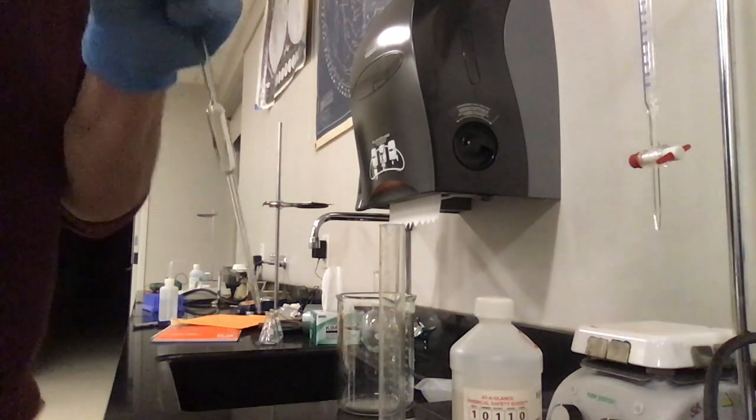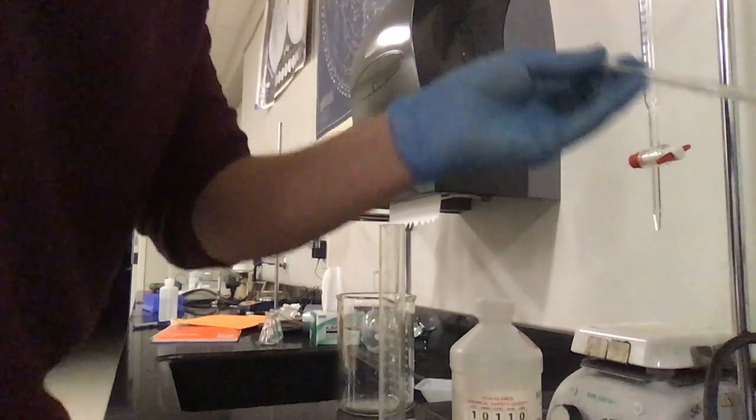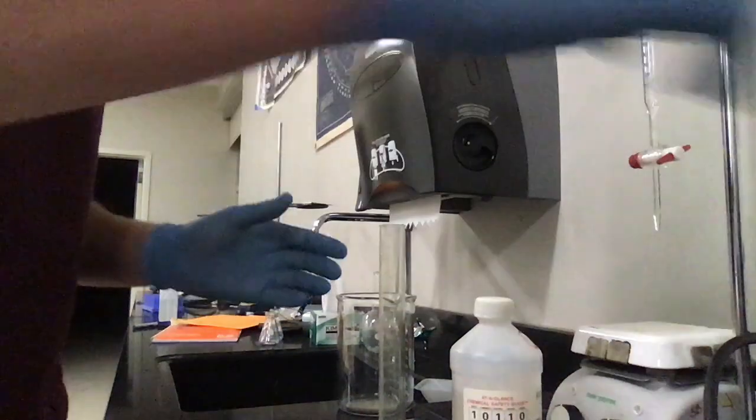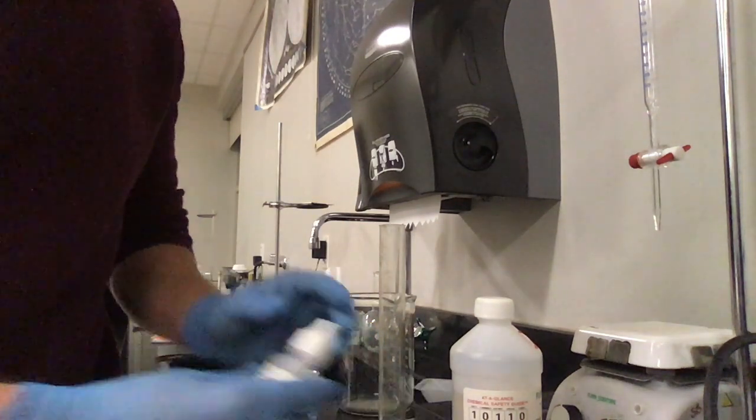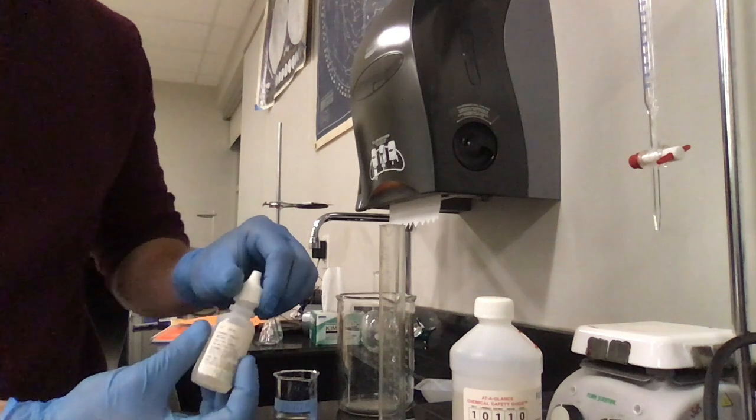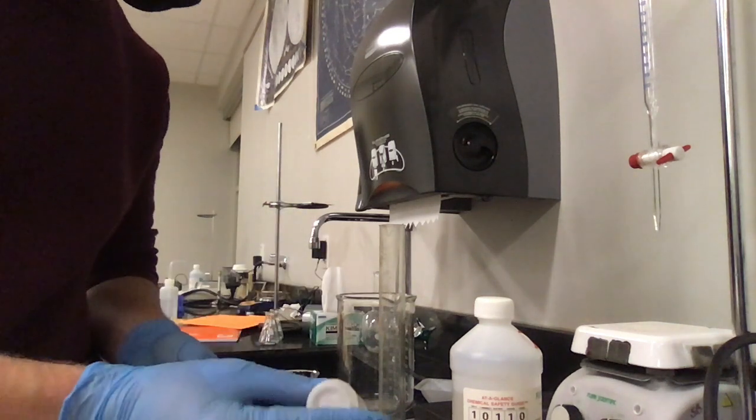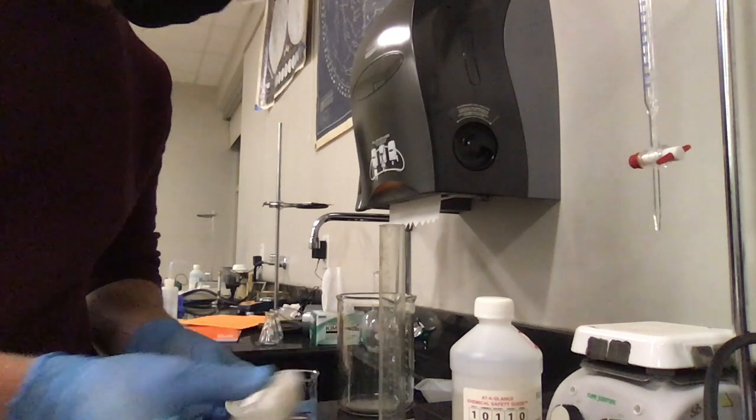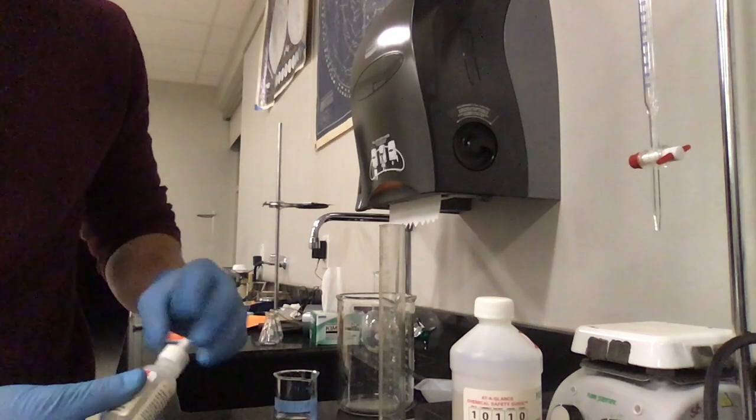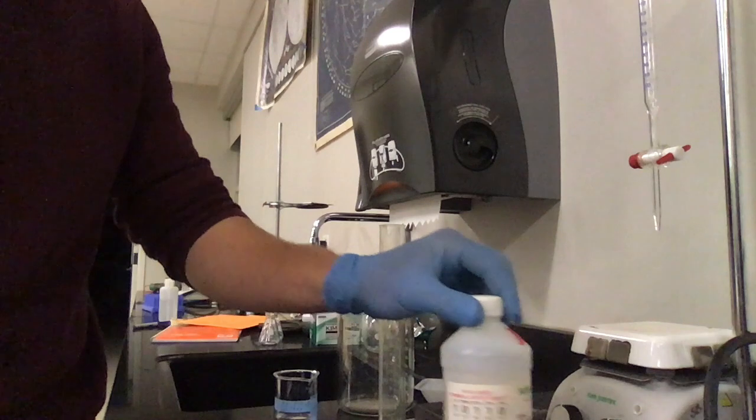I'm going to set this aside because we're going to use it again because I'm going to do three trials for this particular lab. Okay. Now I have unknown acid inside of my Erlenmeyer flask. I'm going to add a drop or two of my indicator. Don't forget the indicator. You'd be amazed. Unsurprisingly, it is still transparent.